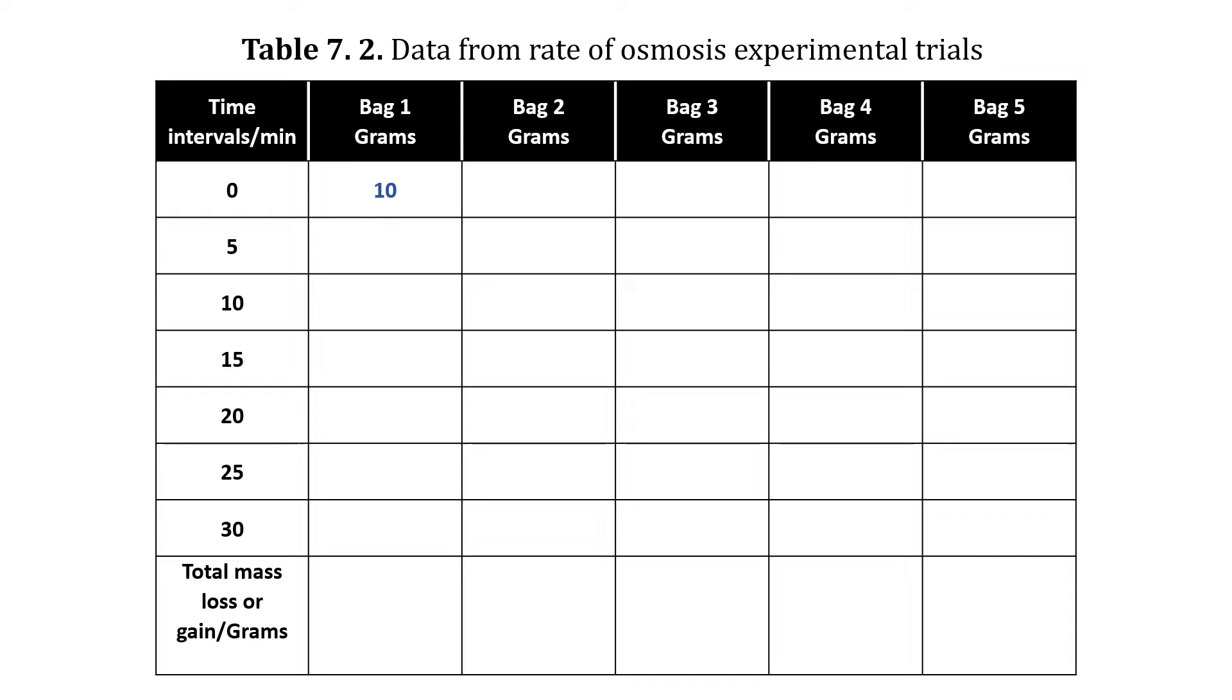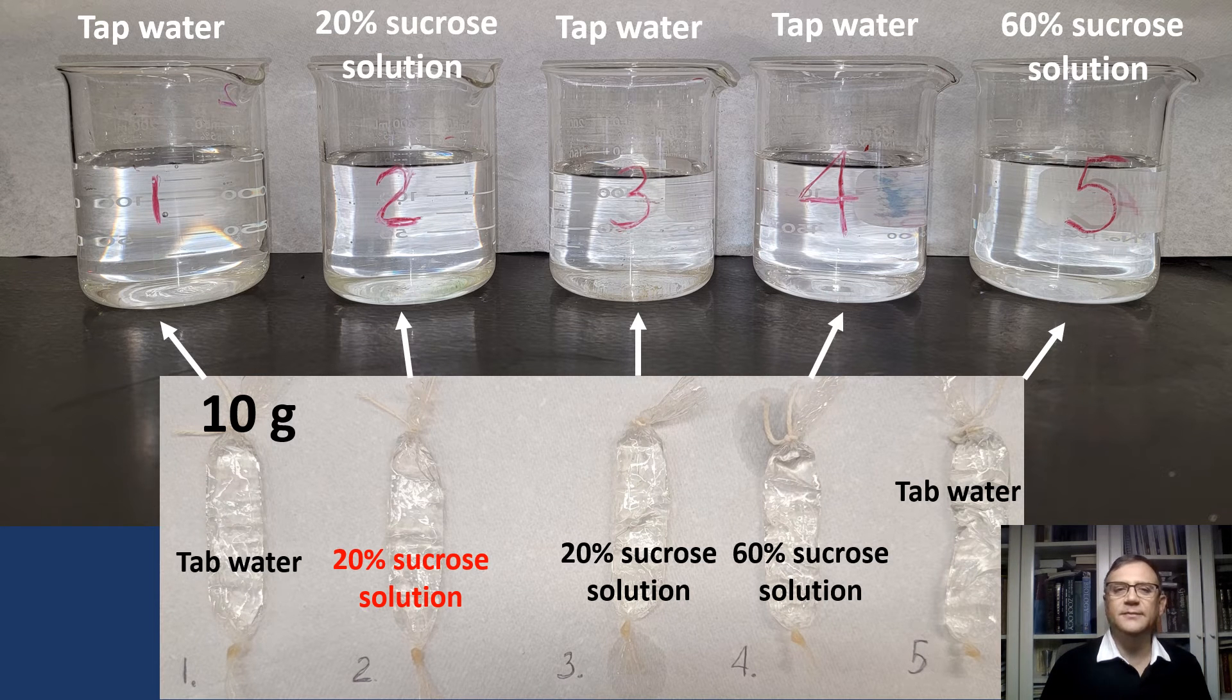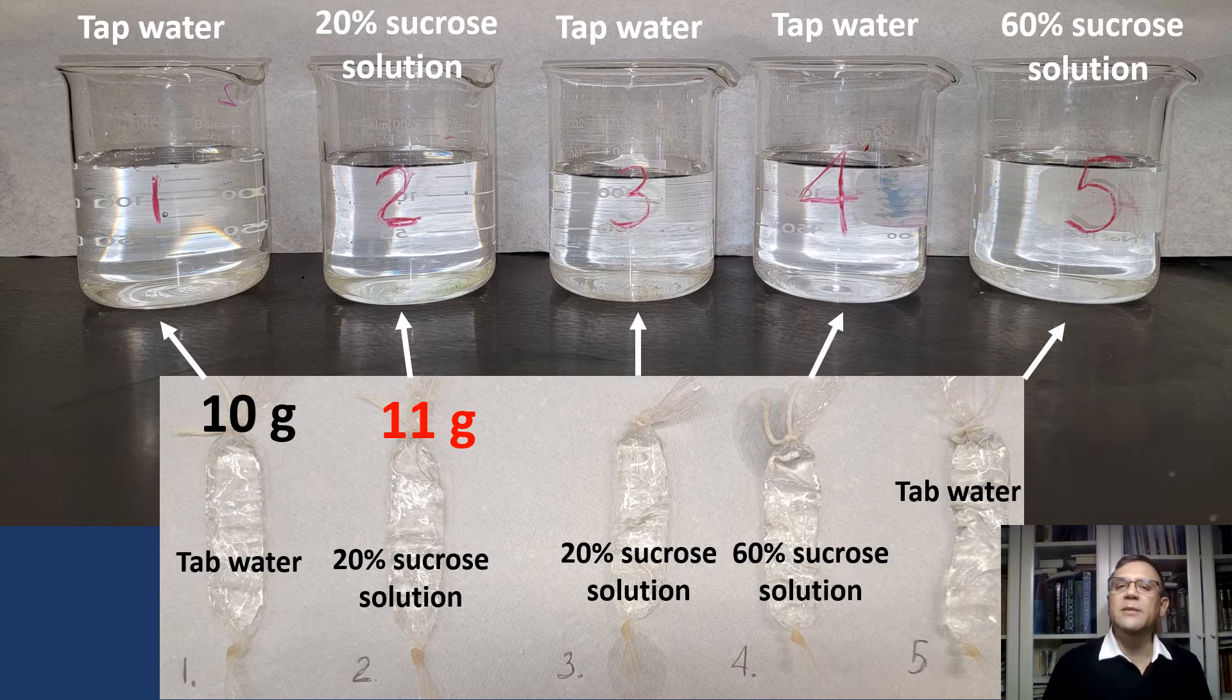If you are conducting this experiment yourself and measure slightly more or less than 10 grams due to pouring more or less of the sample, that's perfectly fine. The exact starting mass is less important. Our main focus is on observing changes in the bag's mass over time. We will track and record these changes every five minutes to examine the differences. Let's measure the mass of bag two. Here it is. Its mass is 11 grams. According to our measurement, 10 milliliters of 20% sucrose solution has a mass of 11 grams. Let's record this in the data table.